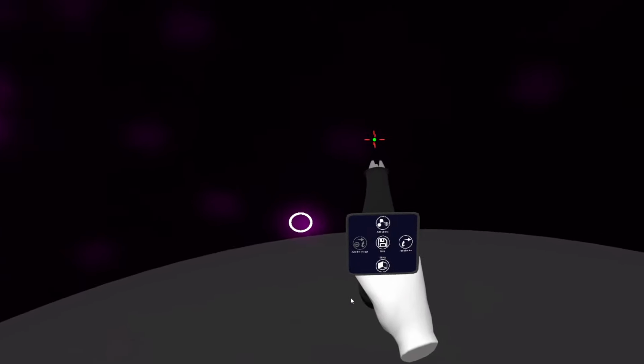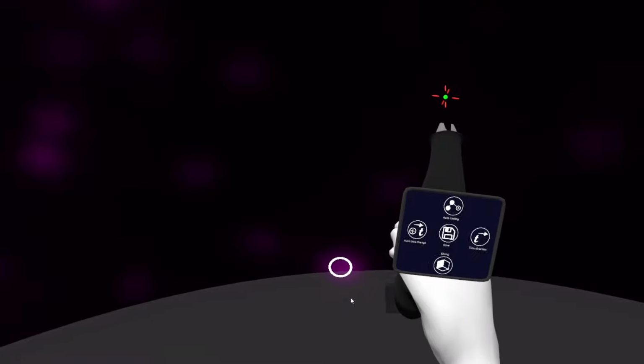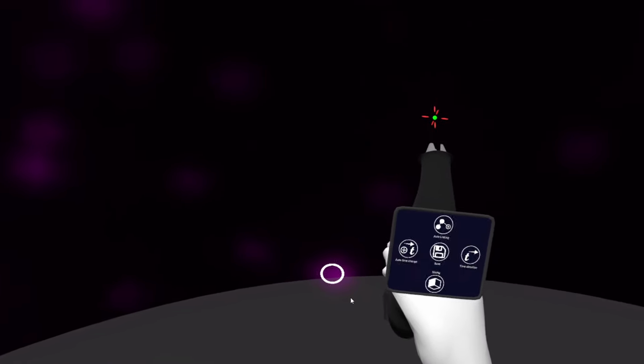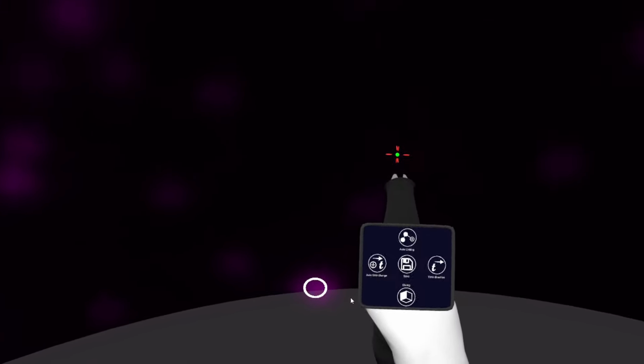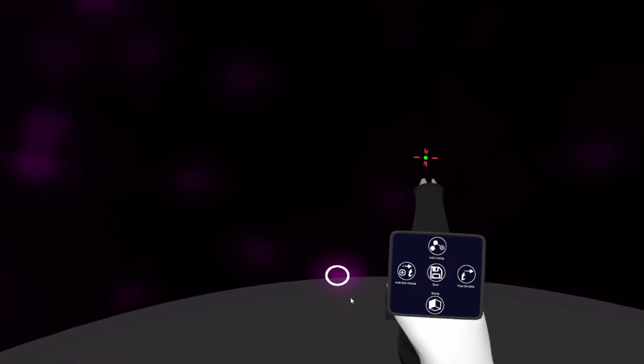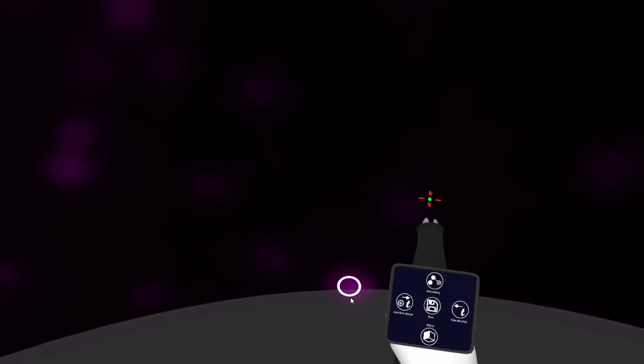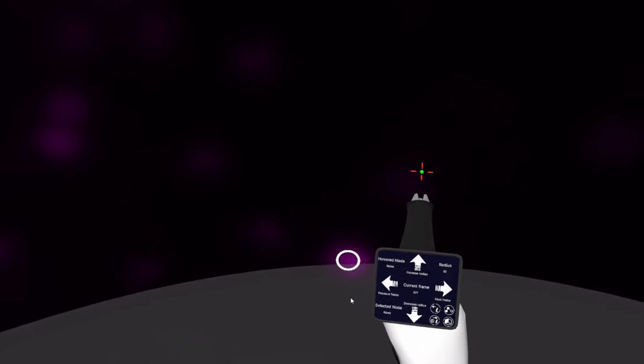So if you press the menu button, you see that on the left you have an auto time change. So this button on the left allows you to change time automatically. And on the right, you can choose the direction, time forward or time backward, right? So if I wanted to track backward from this particular cell, for example, that I have here, I could just do this.